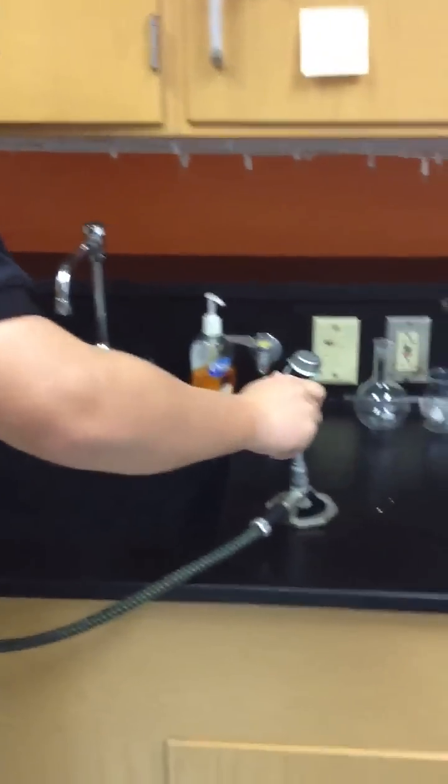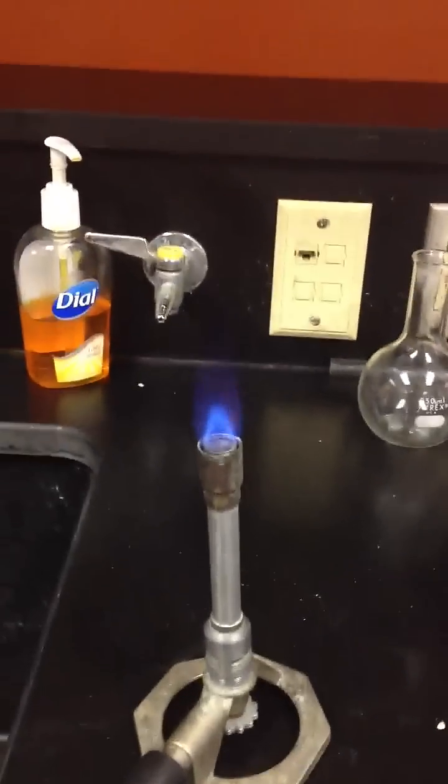Always wear goggles — always wear these because your eyes will explode if they catch on fire. You tell them that. There we go. Perfect. Regular 4th of July right there.